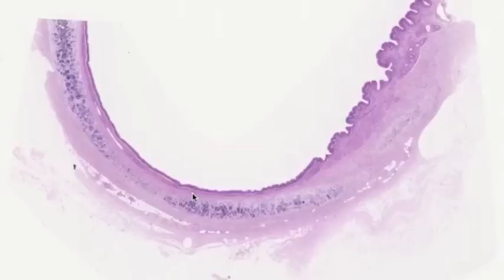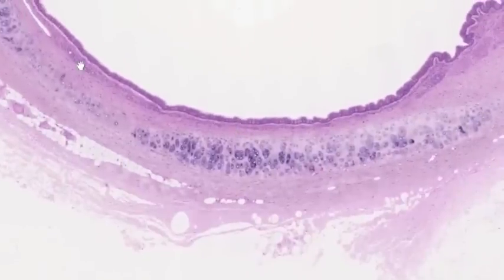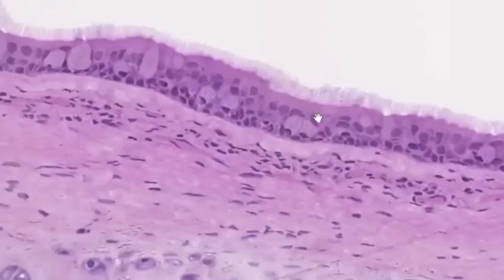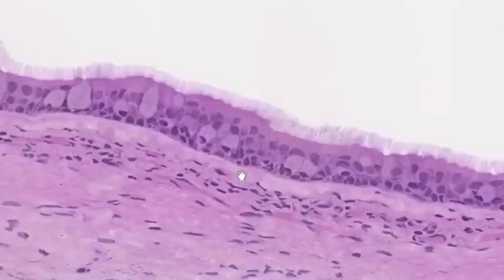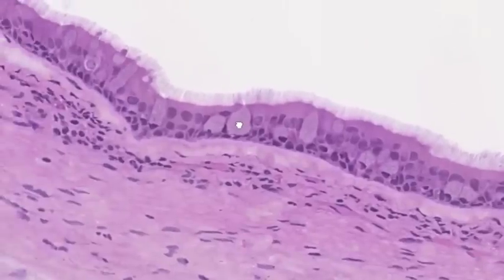Let's take a look at the epithelium of the trachea. This particular slide is a thin plastic section so the cellular components will be very well seen. Here are the cilia on the surface of the epithelium, which belong to tall columnar cells. Because of the pseudo-stratified appearance it's not easy to make out individual tall columnar cells. Interspersed among these are foamy-looking cells — these are goblet cells, and goblet cells secrete mucus.